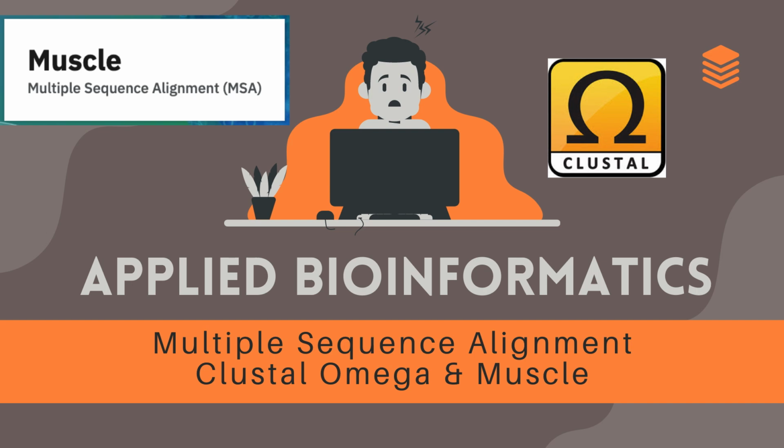Hello and welcome to this tutorial on multiple sequence alignment using Clustal Omega and MUSCLE. In this video, we will learn how to perform multiple sequence alignment using these powerful bioinformatics tools.